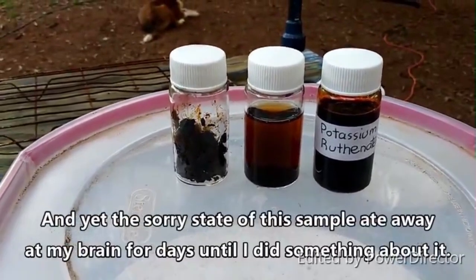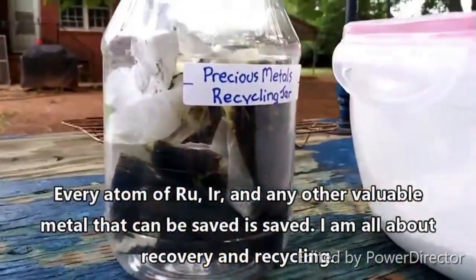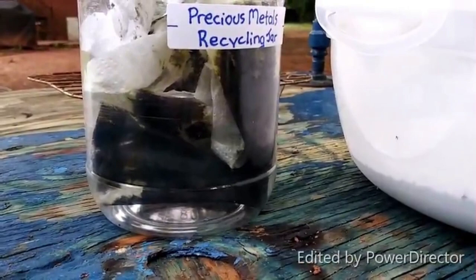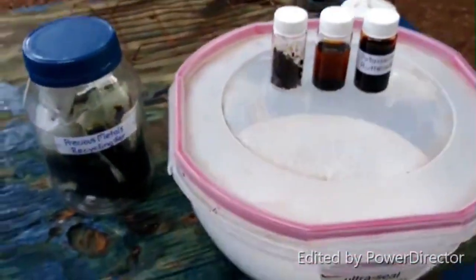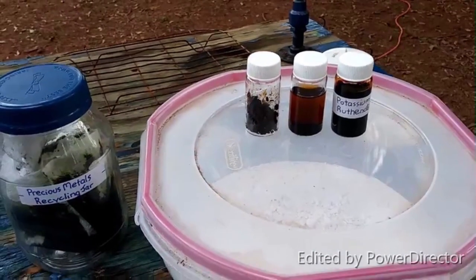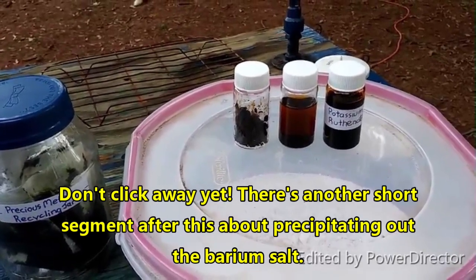I did not expect that to work so well — that is fantastic. I thought I would also show you this filter paper from where I filtered it yesterday. Obviously I'm saving it, keeping everything here from any of the platinum group metals so that they can all be recycled later, because this is not the end of my work with ruthenium or with any of the rest of them. Anyway, this is just so cool. From reading some stuff on a website to putting it together and having it work — that is just so freaking awesome. There you have it: synthesis of potassium ruthenate from ruthenium metal.